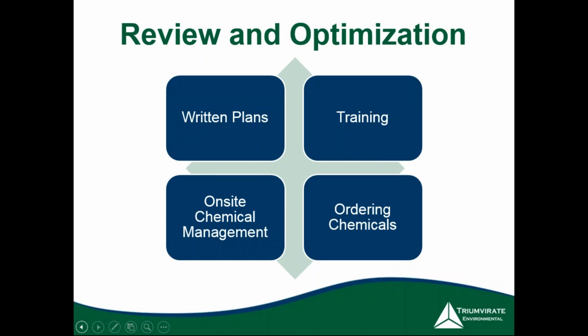And then there's the on-site chemical management part. Like we said, the inventories are a fluid, changing thing. It's important to assess the logistics around scanning chemicals in and out throughout the facility routinely. If you don't, you can have a lot of unseen inefficiencies that build up and really affect the integrity of your program and its effectiveness.